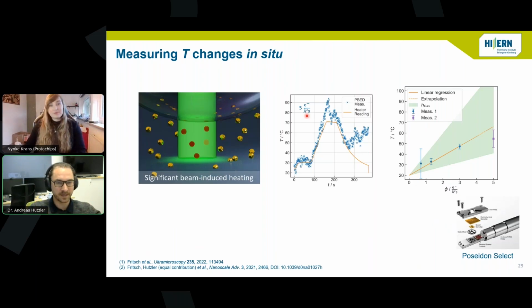When we have a highly parallel electron beam, then also a change in height does not make any change in the diffraction ring radii. And that's what I meant with advanced microscope alignment. It turns out that the factory alignment is not enough for these kinds of measurements.